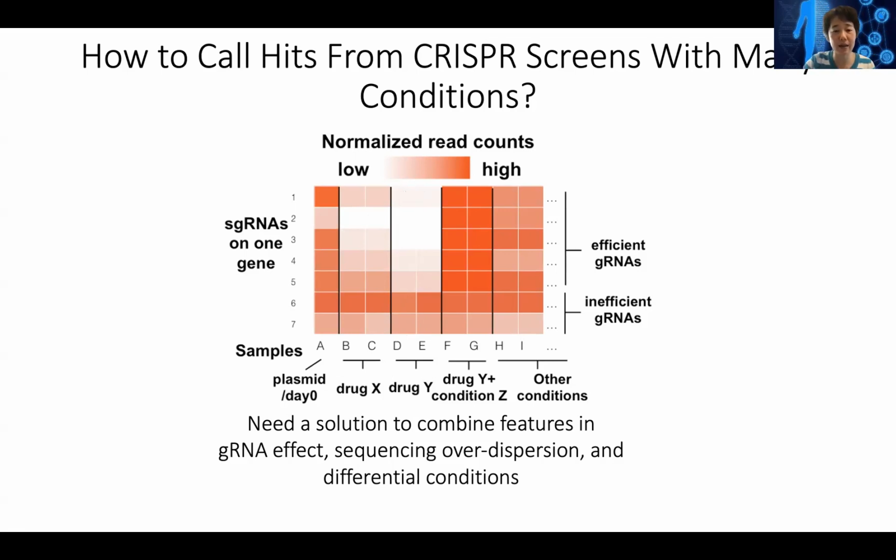The approach we're using is an expectation maximization approach. You can imagine it like this. Initially, we have 7 guides from the design. We can use our algorithm, based on the sequence and conservation, to say, okay, roughly this is a good one, this is not so great. Or if you don't even know, you can just say, okay, initially all the guides are equally good. This is like students coming to Harvard. We use their GPAs and SAT scores to roughly decide, okay, these are good students, these are mediocre, these are probably not so great students.